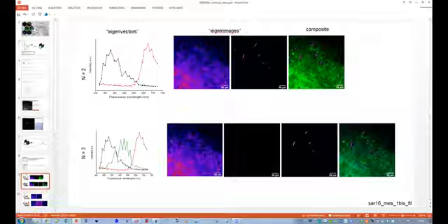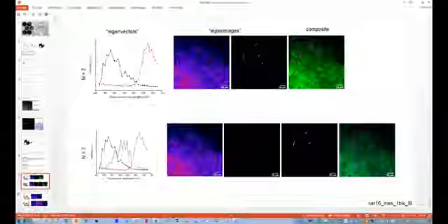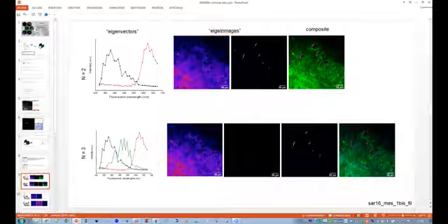I guess the residual is probably the Euclidean distance between the spectrum on a given pixel and the linear combination of the different eigenvectors. Yeah, so you can get the diversity and the variability within a given class of pixels. Okay. Maybe we could discuss that together to do something stronger.